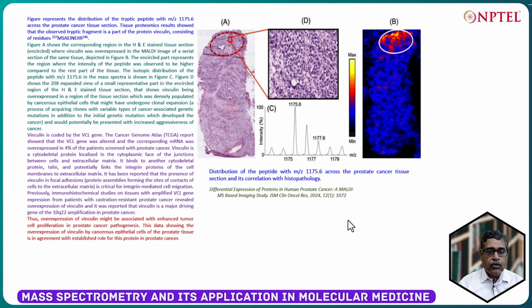And then we ruled out 41 because of not very clear distributions across the tissues. Then we removed 8 which are uniformly distributed, out of which I showed you one example. And then we are left with 3 interesting ones which are perhaps related to prostate cancer.